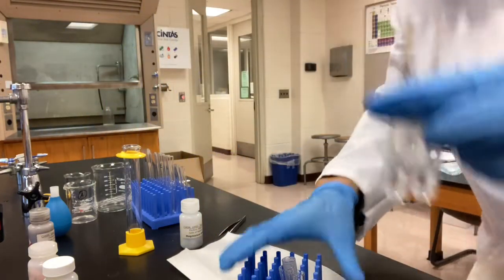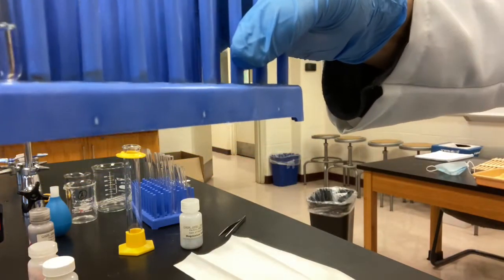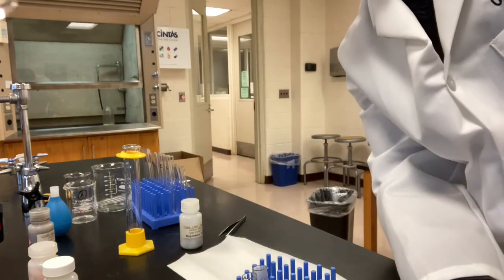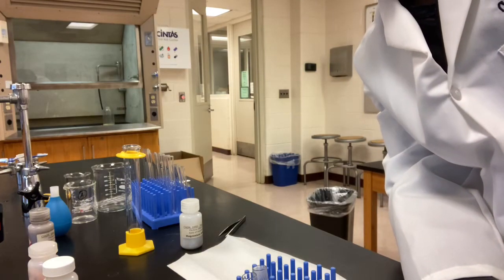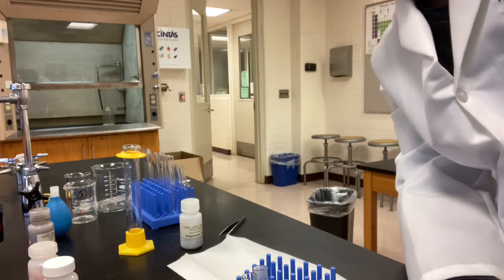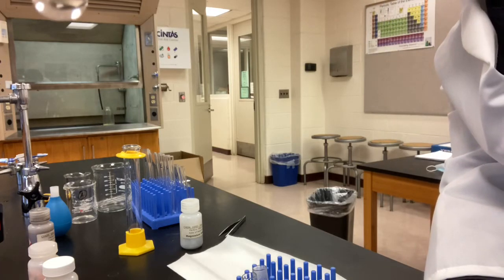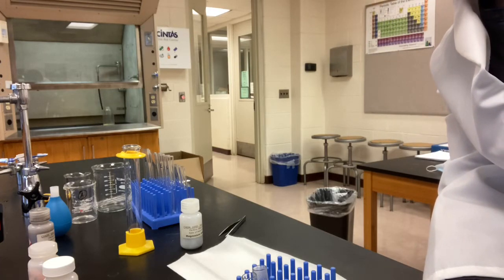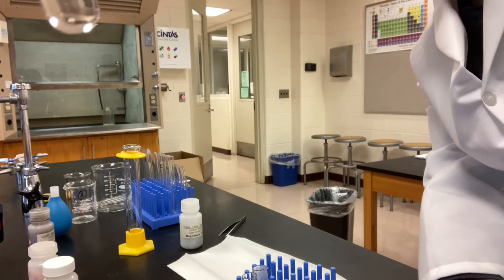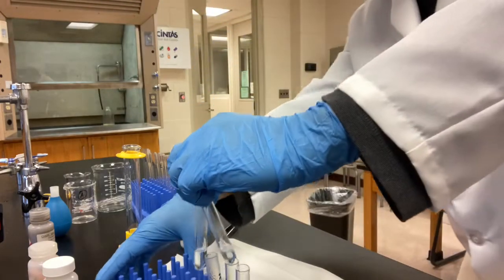These two, all the magnesium is gone. These two are still reacting. All right, so looks like number 5 is actually reacting faster than number 4.